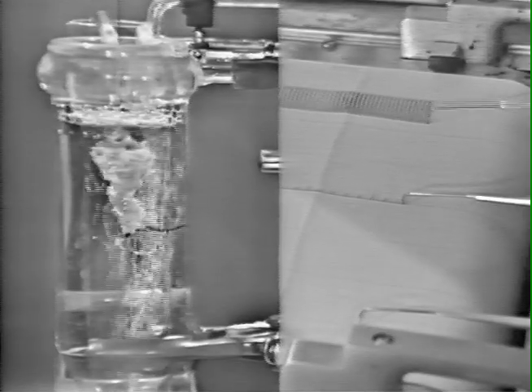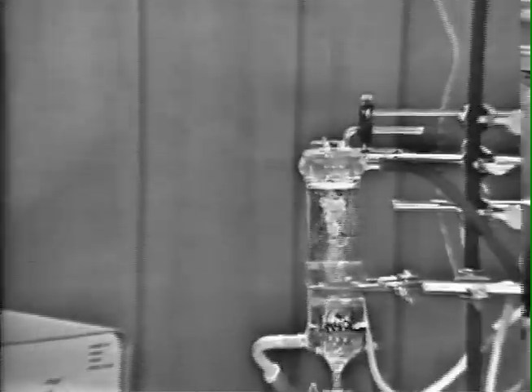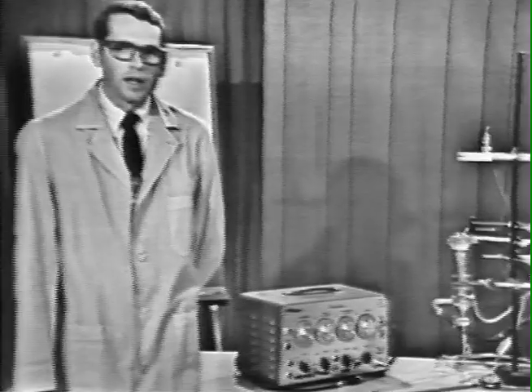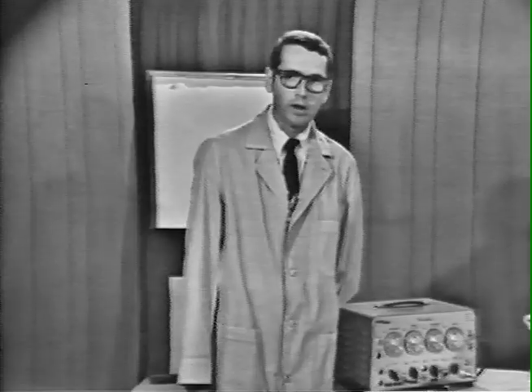The response that we obtain with this dose of tyramine will probably be near the maximum response of the tissue. In this particular preparation, that is on the order of 220 beats per minute. All right, I think we've seen the response to tyramine in this case, and what we will do now is obtain the maximum response to this drug. Then we will wash the tissue out, and after it comes back to a baseline or the control contraction rate, we can obtain a response to isoproterenol.